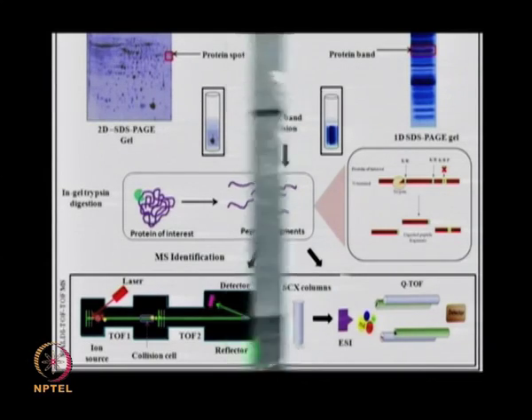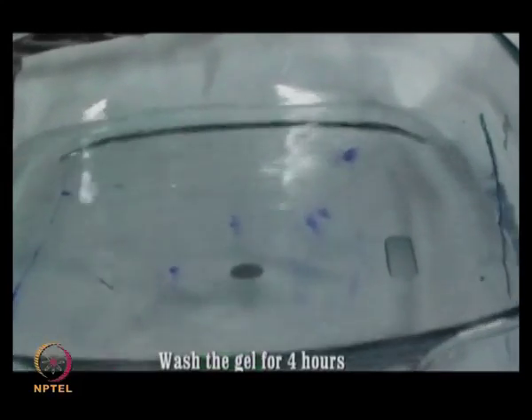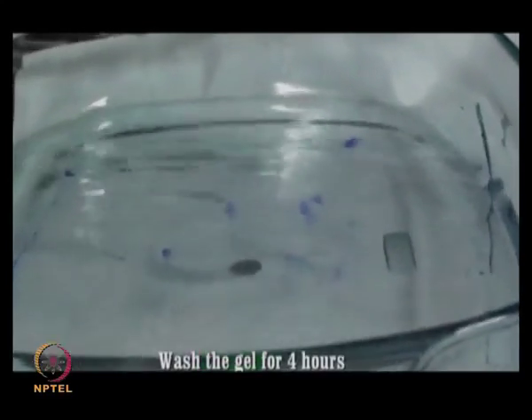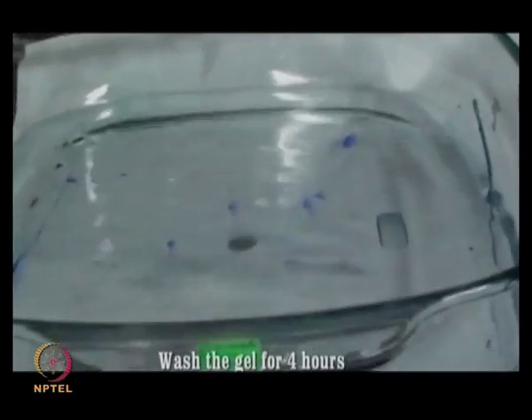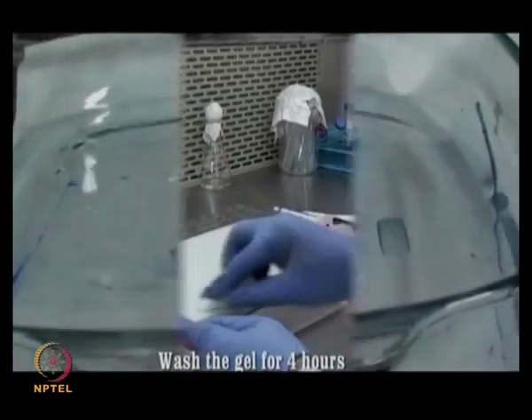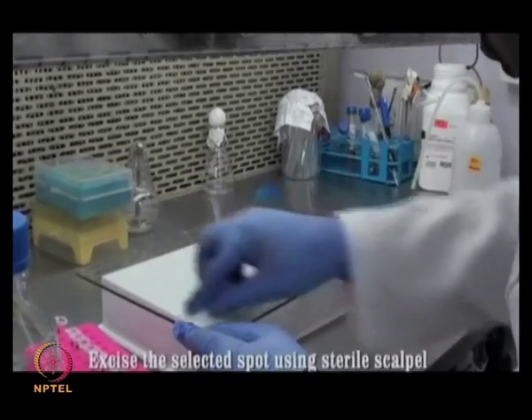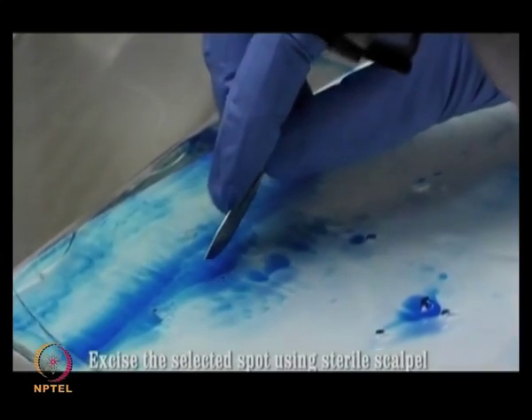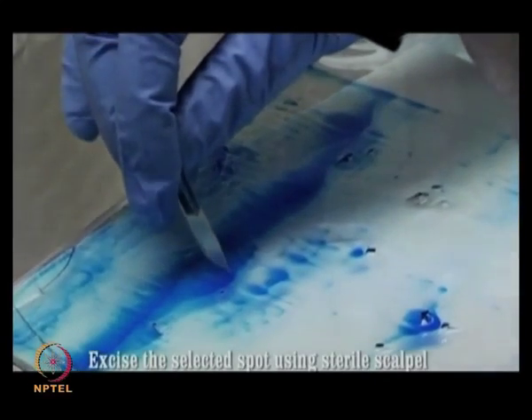So, let us say you have run a gel. First of all, you need to rinse the entire gel with water for a few hours with intermittent changing of the water. Now, you would like to excise the band of interest or the spot of interest. So, keep a glass plate inside a laminar hood and clean the surface carefully.